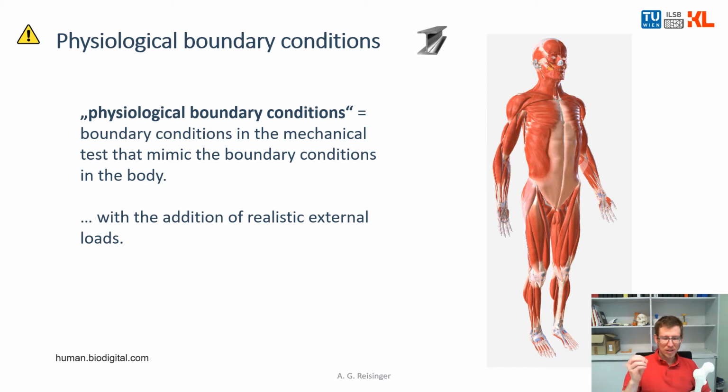And in addition to that, for example, you would like to measure the fracture load of the bone in the case of a car accident. Then, when you consider a car accident, the person is sitting in the seat. So the bones have a certain alignment to each other. You have a certain excitation or activation state of the muscles. So the muscles are exerting defined force on the bone.